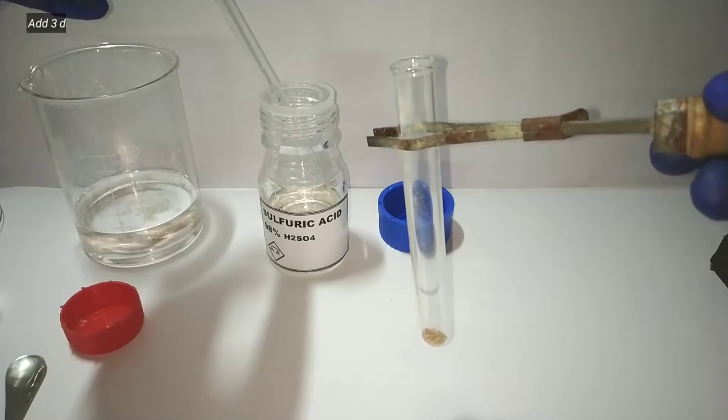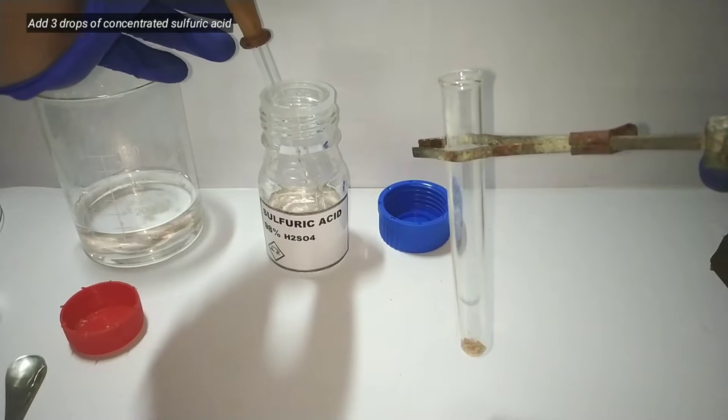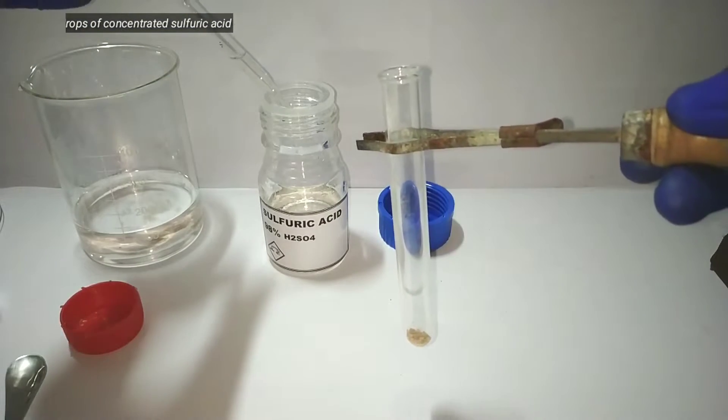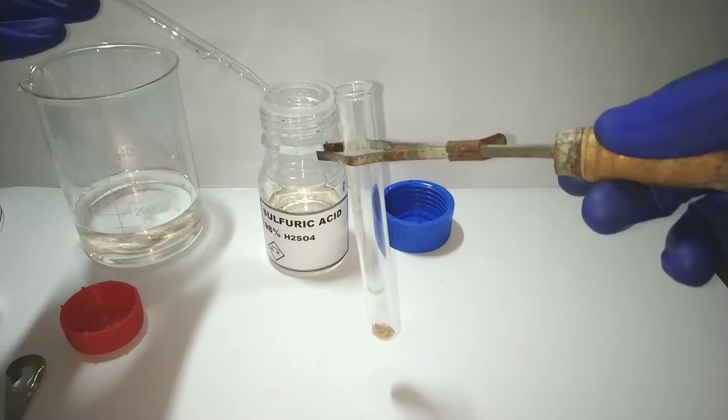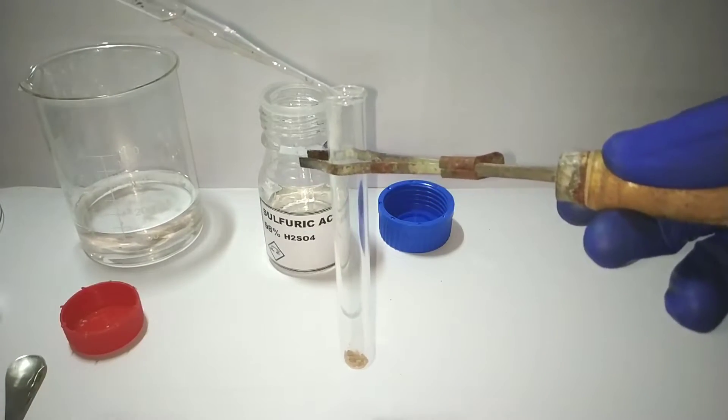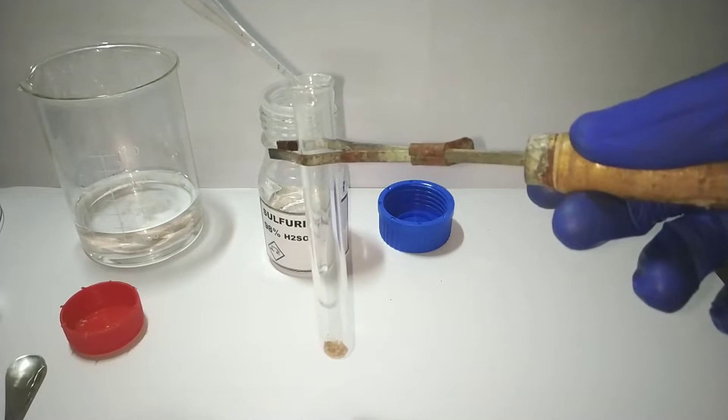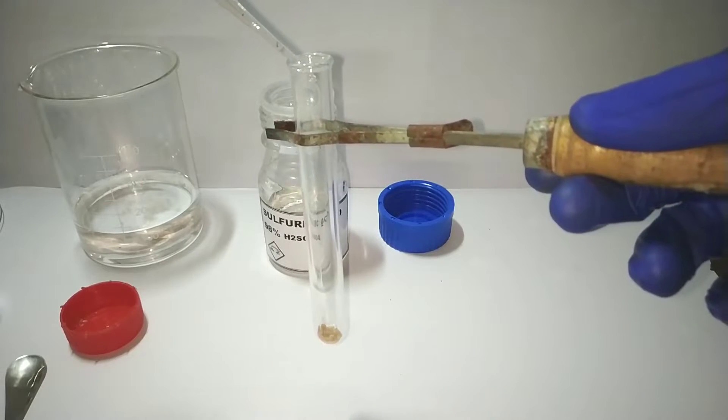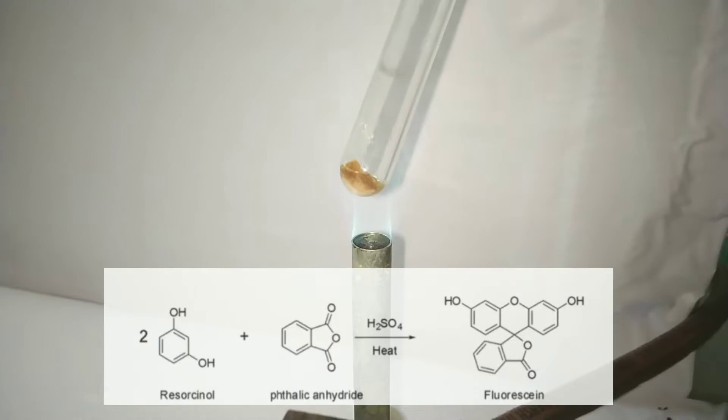Now we add three drops of concentrated sulfuric acid over it. Do not add too much acid.